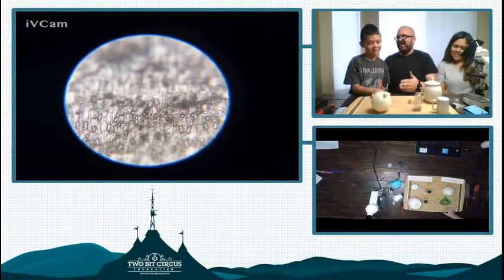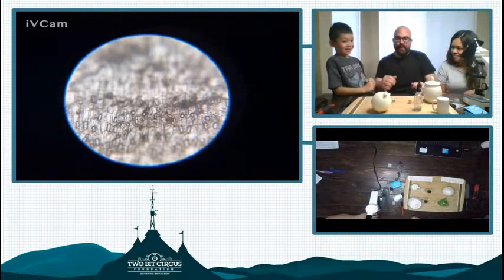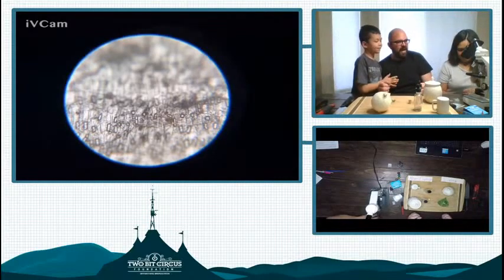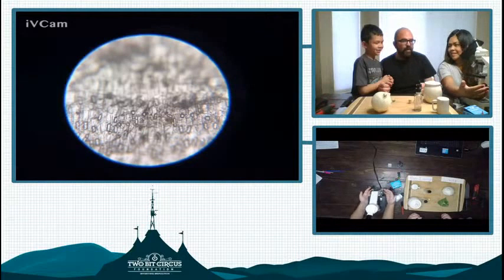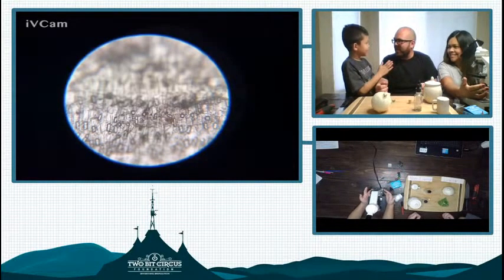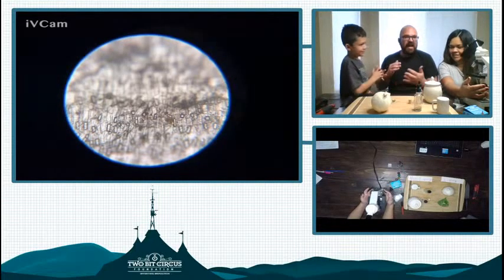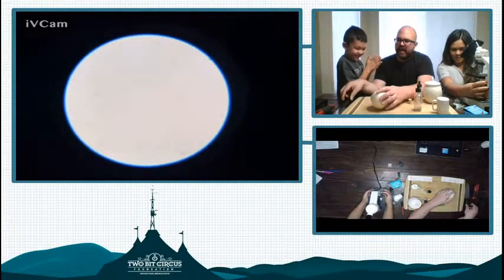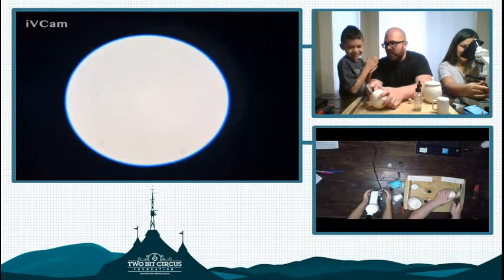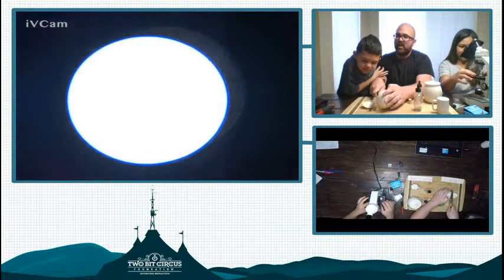Awesome. Well, anyways, that was a nice sidebar to teach us a little bit of history of science and the people behind it. But we should get back to our little story here about Robert Hooke and the microscope and the cells that we see under there. So Robert was correct. An onion is alive. Now, before we move on, I would like to actually cut open the onion. Ooh. And we could try to get a smaller layer in here that's flat.